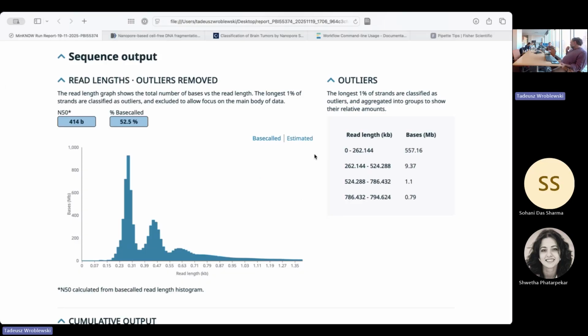I understand one benefit is that you get all the data. The time it takes for sequencing, it's also base calling in the background. You can do analysis right after your sequencing is done. Whereas now we're going to have to wait 3 more days. And also, it is longer now. So even 5 more days then. Whenever we do it using the standalone Dorado, it is more time consuming.